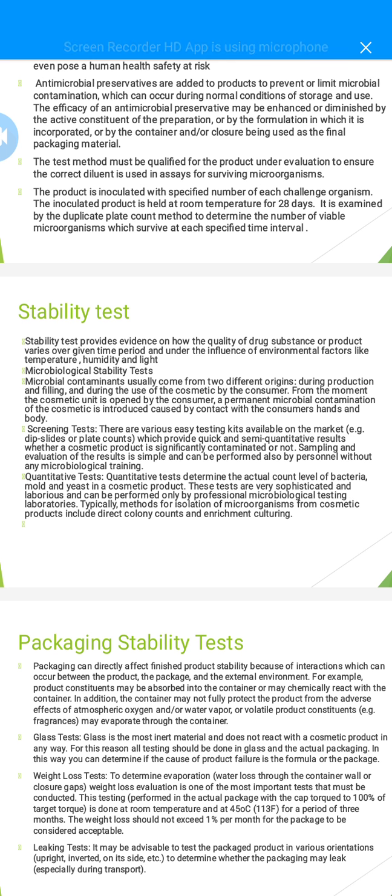Coming to the plate counts. Plate counts are tests in which we inoculate the microorganism on one plate, and we can compare one plate with the second. These provide a quick and semi-quantitative result whether our cosmetic product is significantly contaminated or not. Sampling and evaluation of the result is simple and can also be performed by personnel without any microbiological training.